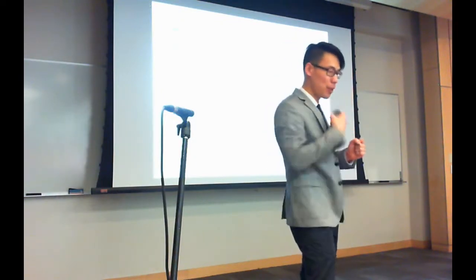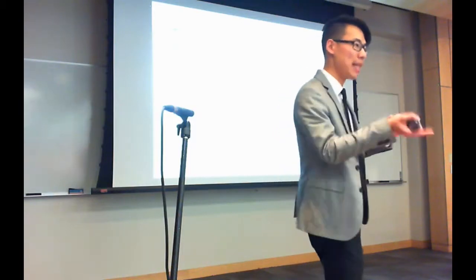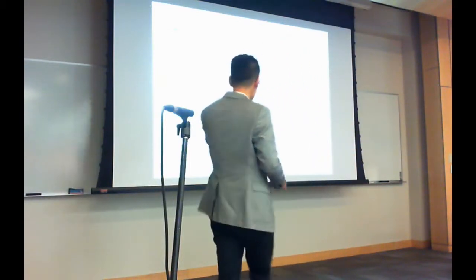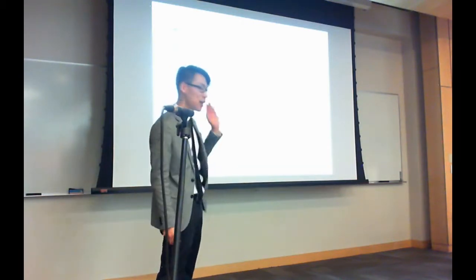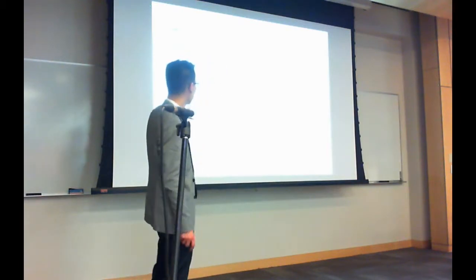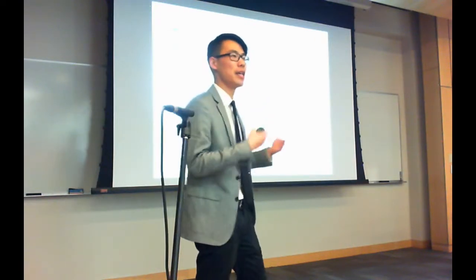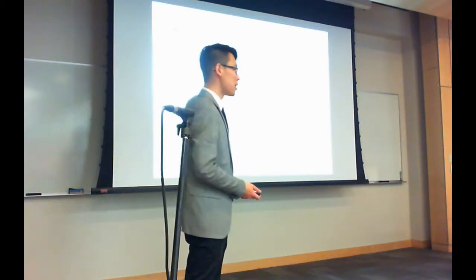that spectrum, how likely is it that all random peptides that match to this particular spectrum have a low score? And then if we take 1 minus that value, that will give us the probability of at least finding one random match with a high score. And so this is the error. The lower this score is, the more we trust the identification being made. And so this takes into account the quality of the match as well as the search space we're considering.